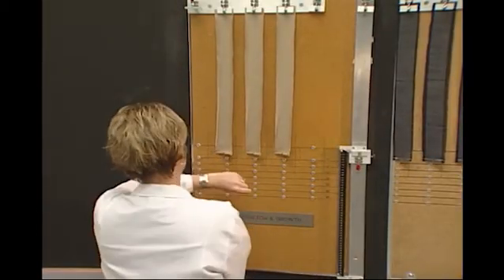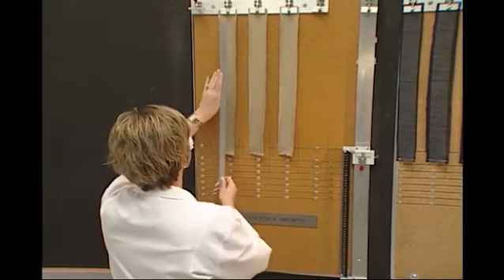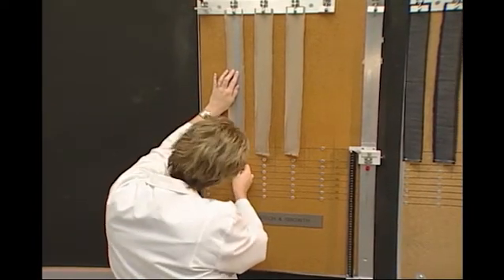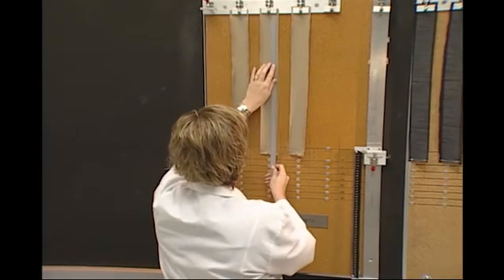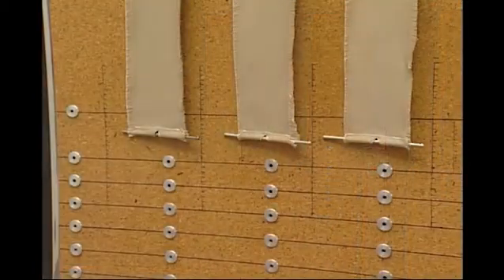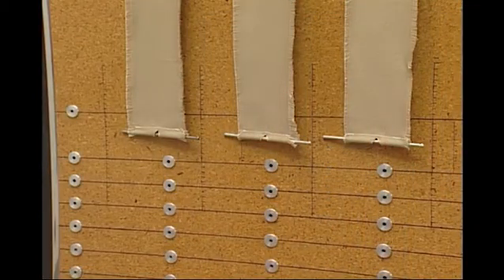A specimen is locked in place in the upper clamp, and the distance to the sewn line on the folded end of the specimen is checked and adjusted if needed to ensure the starting distance to 20 inches. The extension used for this growth measurement is 85%.